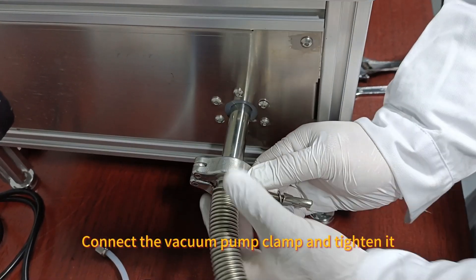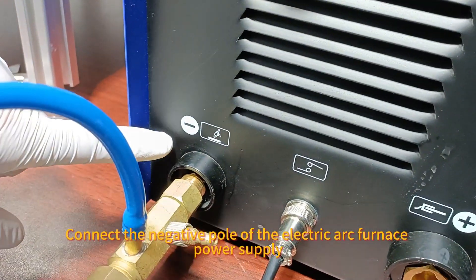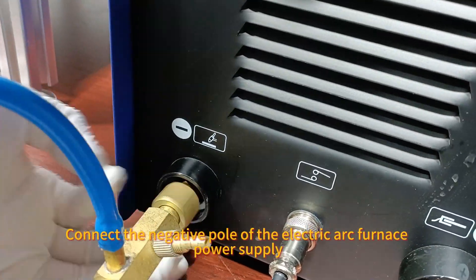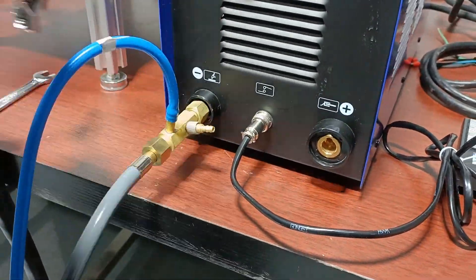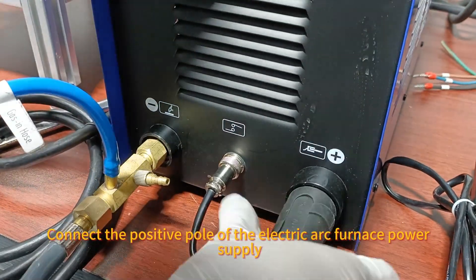Connect the vacuum pump clamp and tighten it. Connect the negative pole of the electric arc furnace power supply. Connect the positive pole of the electric arc furnace power supply.